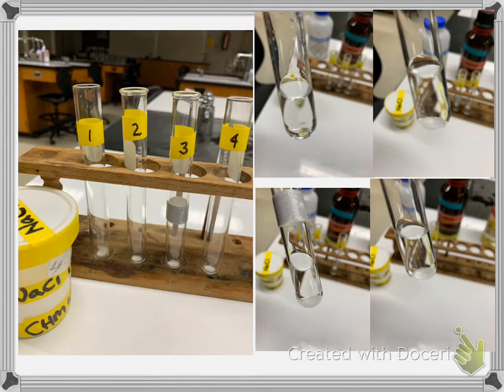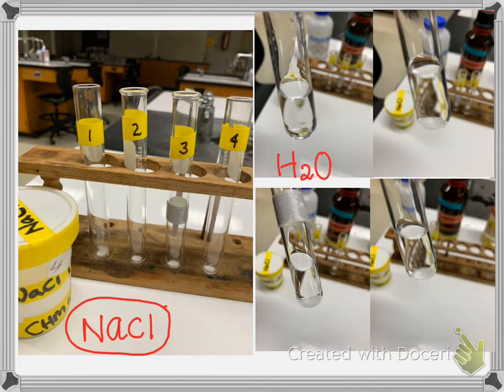So let's take a look at this again. So all of these have NaCl. That's what they all have in common. I had it backwards in here. So this is NaCl in water. This is NaCl in ethanol. And I'll tell you how I realized my mistake before I got any further. This is NaCl in acetone.